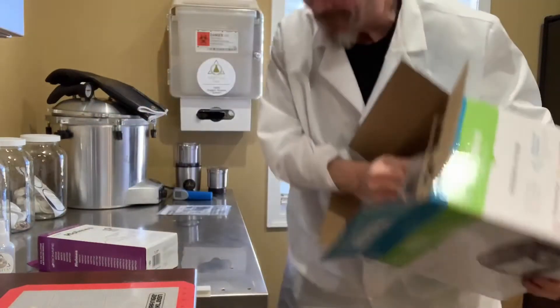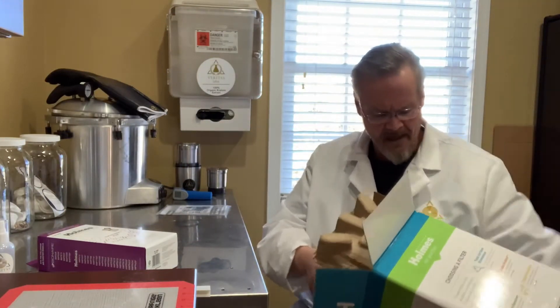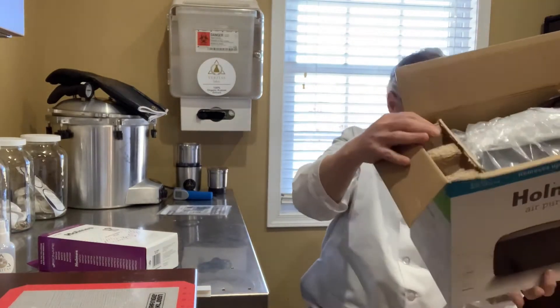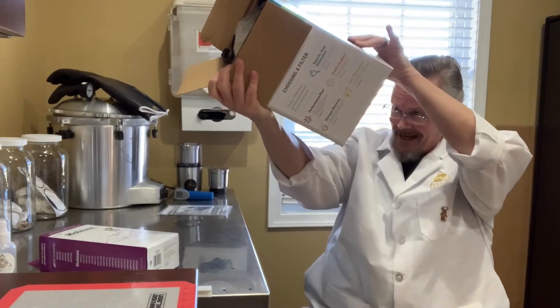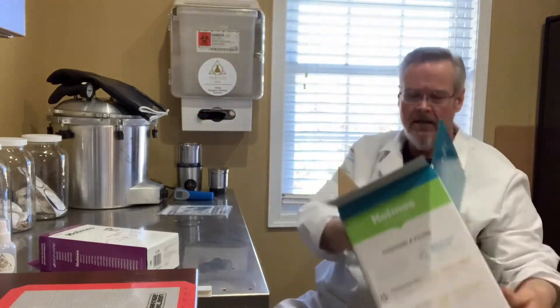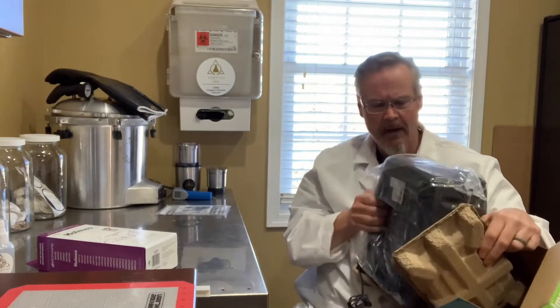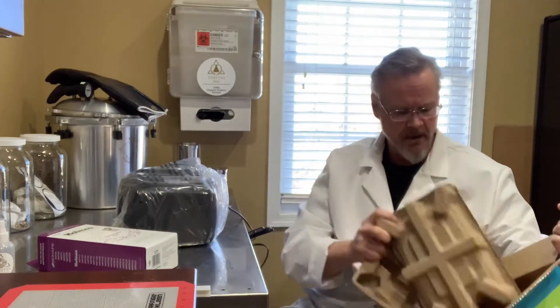With inflation, that is the new economy and that is the new low-tech flow hood. Let me unbox this thing for you. It's very simple, and by the way, the model number on this is the Holmes Air Purifier, model number HAP9241, filter number HAPF300APD. These are very, very simple — that's why I like it so much. It comes very well packaged and very secure.